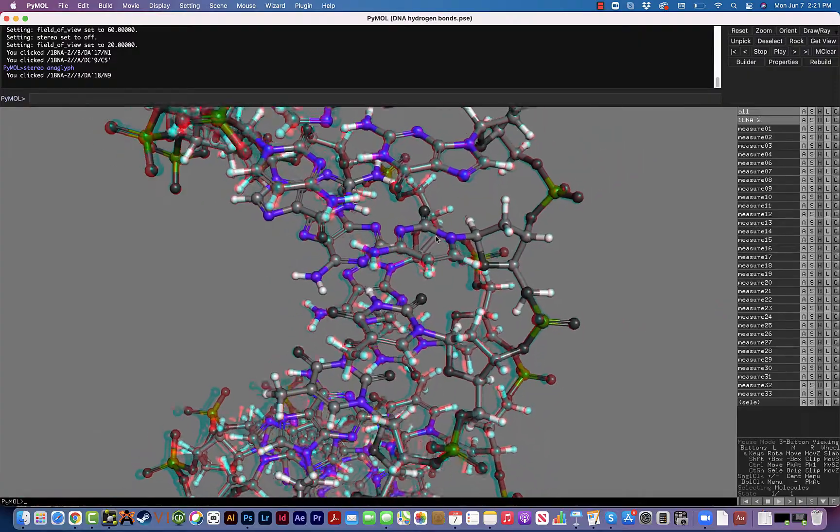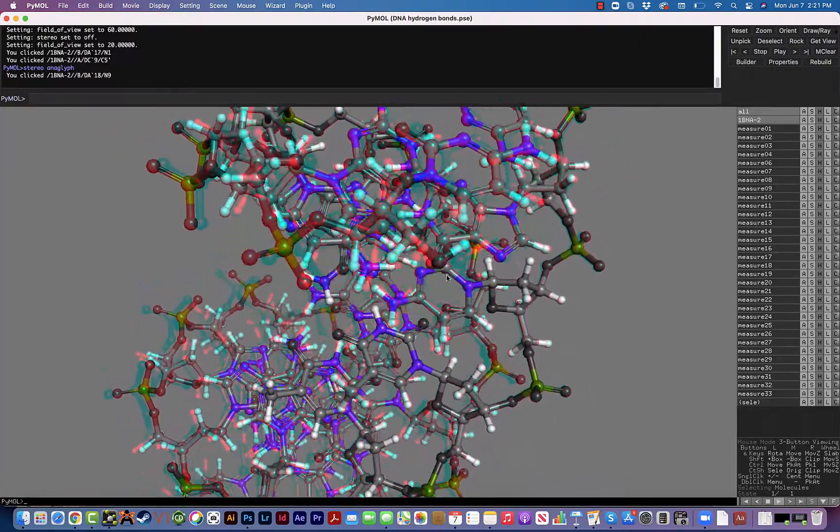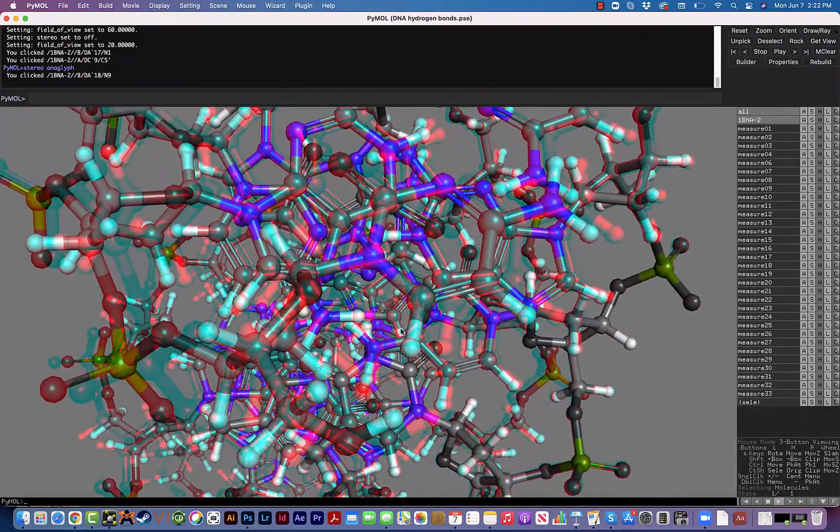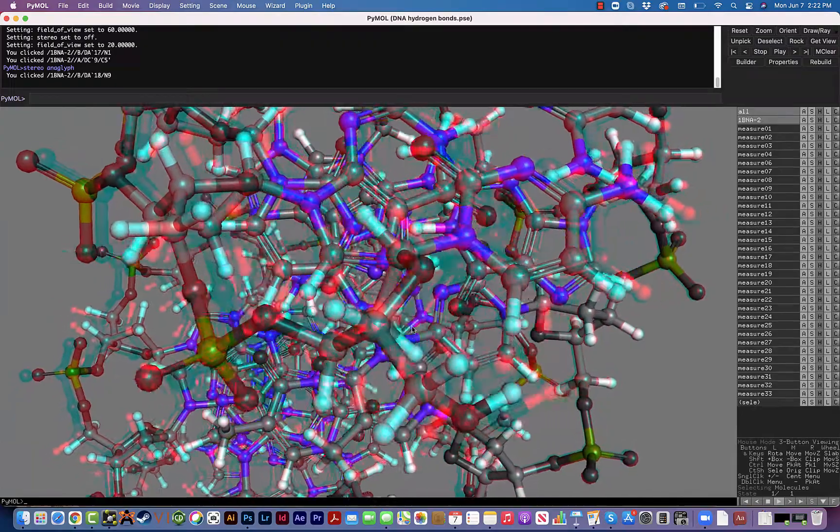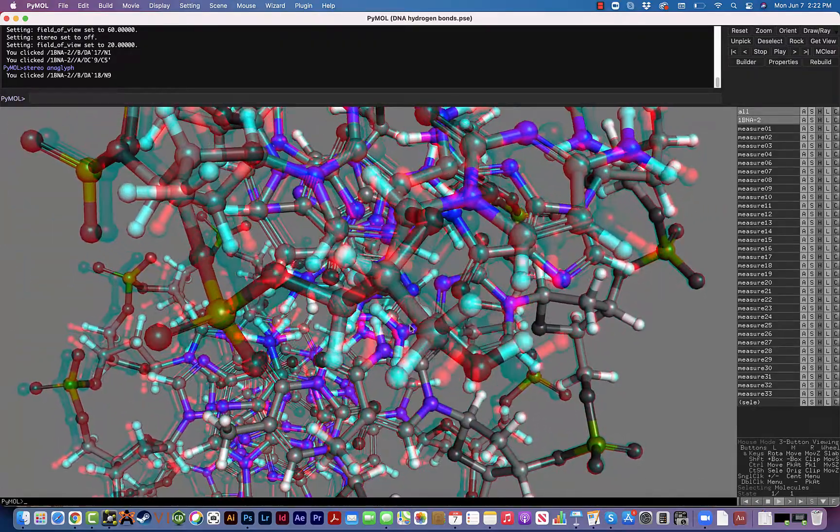Some of the kids will actually try to grab it right out of the screen and it's very impressive, especially things that are more in the foreground like this part of the DNA molecule.